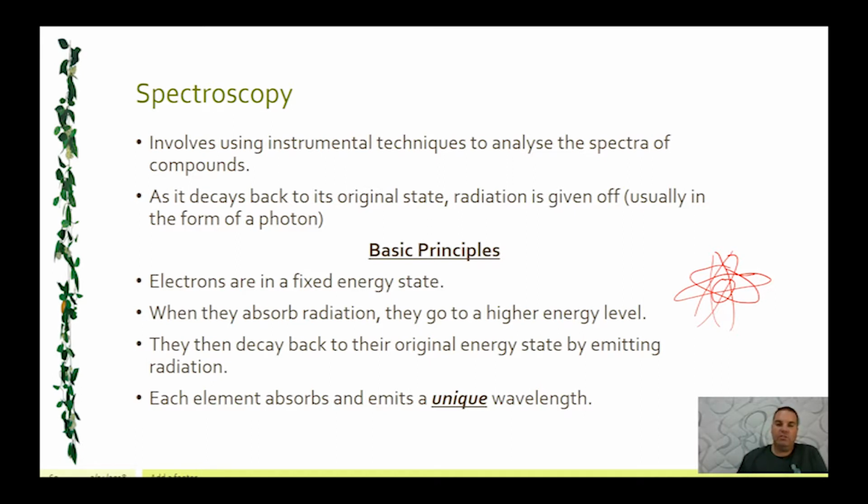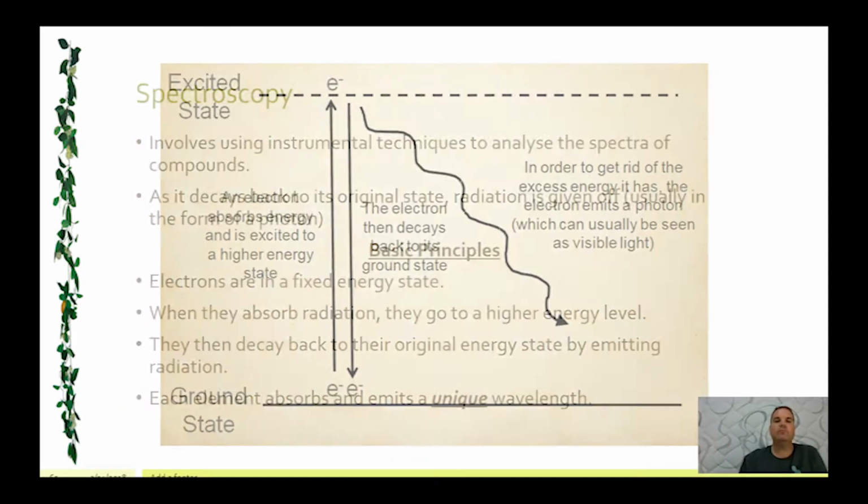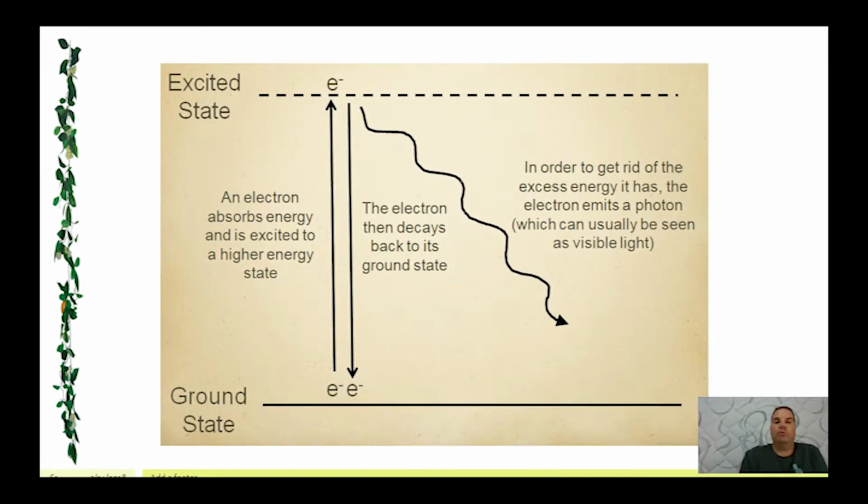Now, one of the key things you need to remember is this statement here. You need to learn this, really, really important. Each element can absorb and emit its own unique wavelength of light. And that's really important. So here's an example showing what we're talking about here.